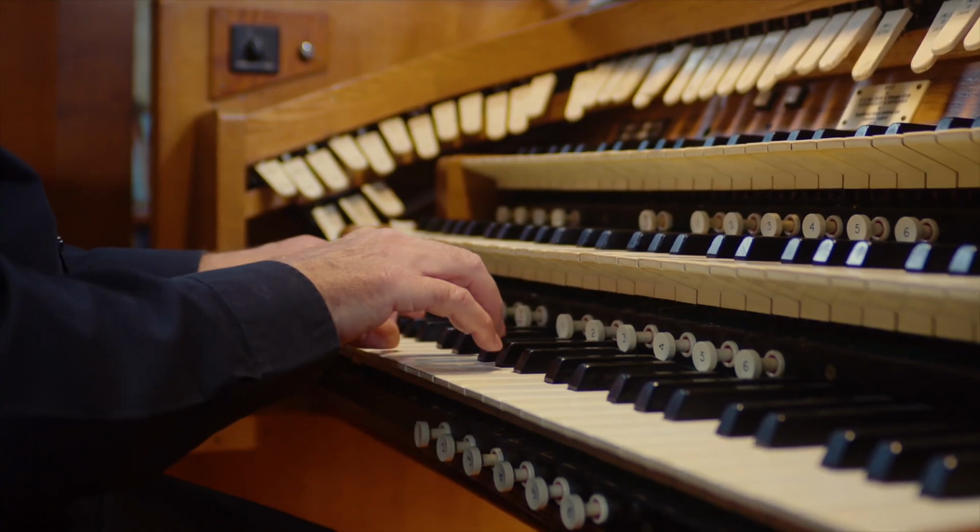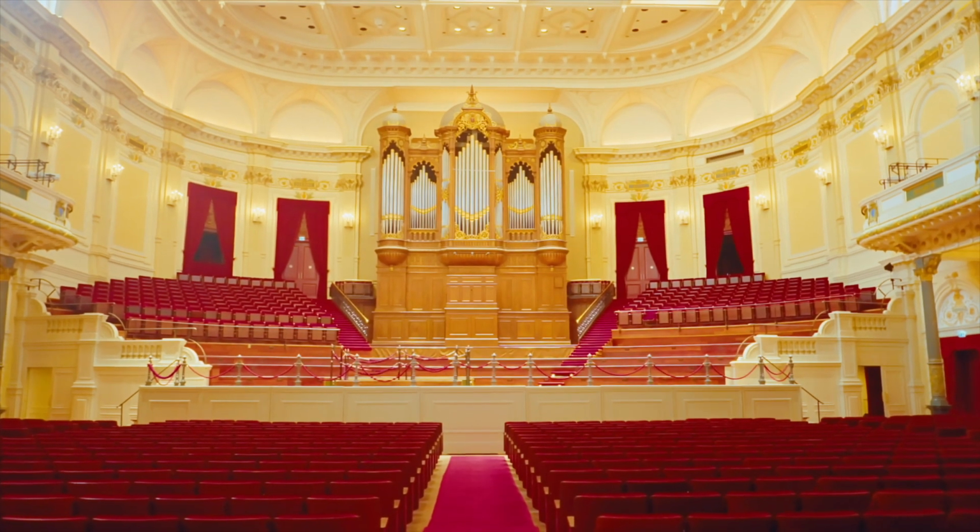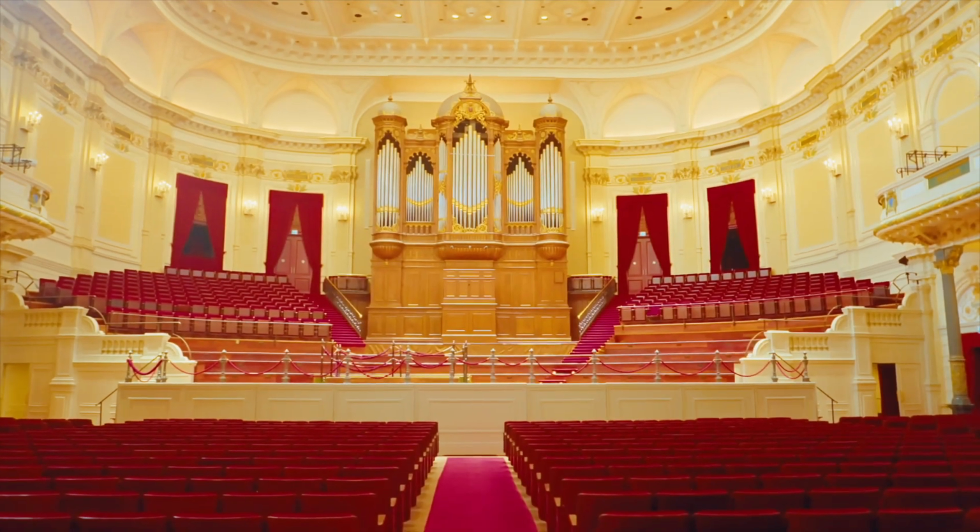Enhancement, on the other hand, is like an echo in a large hall. The sound becomes louder as it bounces off the walls. In XRF, heavy elements like nickel can amplify the signals of lighter elements like iron. In real-world applications, matrix effect can lead to inaccuracies if not accounted for. For instance, in an alloy with a high concentration of heavy elements, the results for lighter elements might be understated.